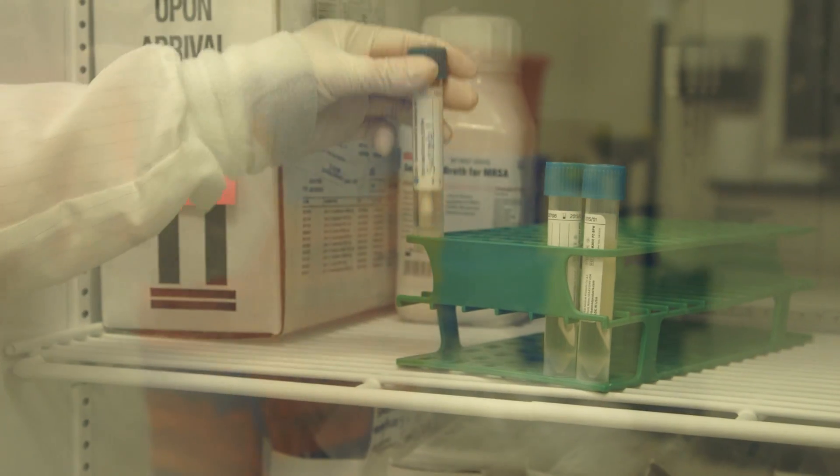If immediate testing cannot be performed, place samples in a refrigerator until testing can be performed.